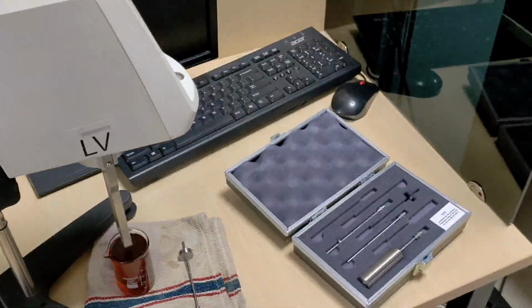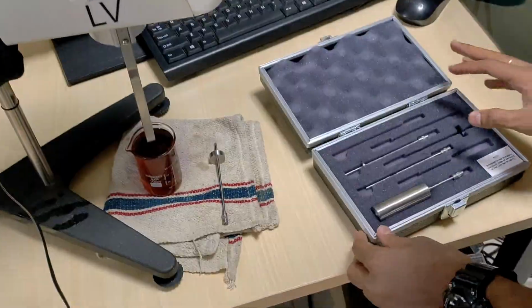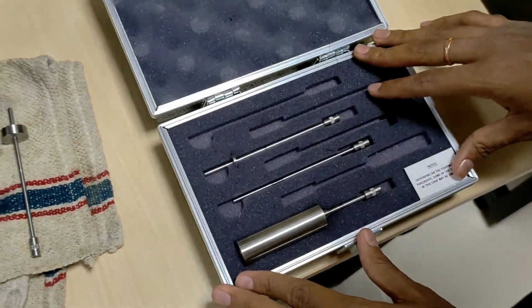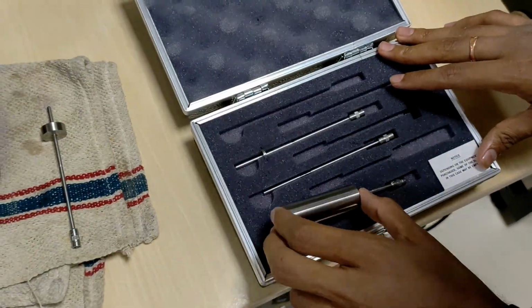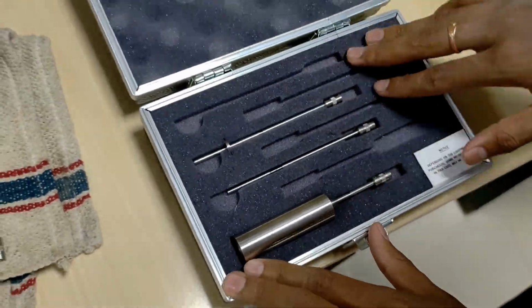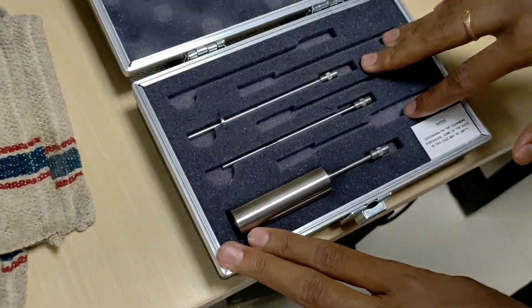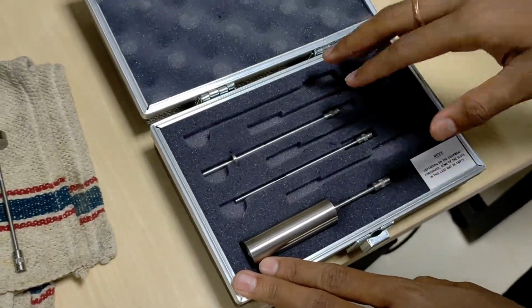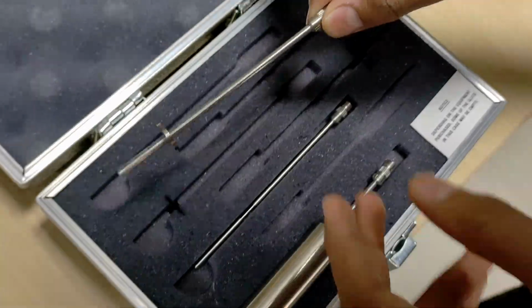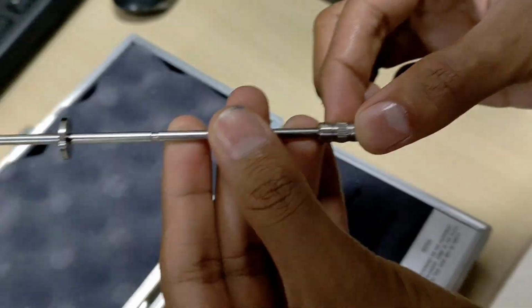So this is the Brookfield Viscometer. This is an electronic device which calculates viscosity. It uses these tools. It is a disc with different diameters and height. These are called spindles. They have different numbers for identification. In our department the numbers vary from 61 to 63. It is written on the spindle.